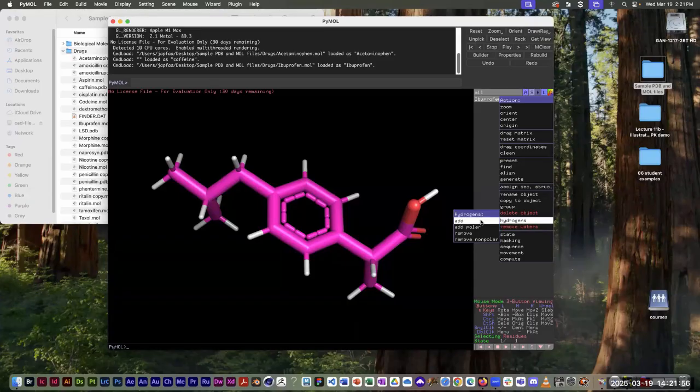Well, sometimes even these 3D molecular model files come in without all of their hydrogens. You'll have carbons that don't have the right number of bonds. So what this command does is it calculates the valence for every atom and makes sure that it has a full valence. And if it's got carbons that only have 1 or 2 bonds on them, it adds the missing hydrogens.